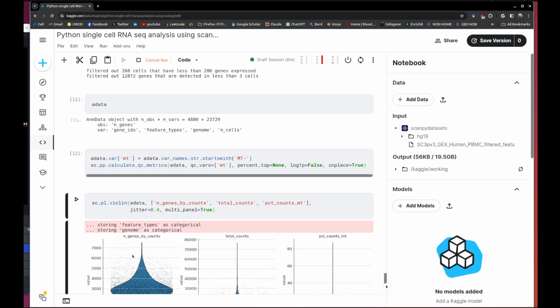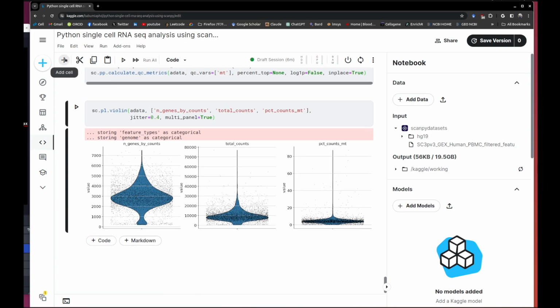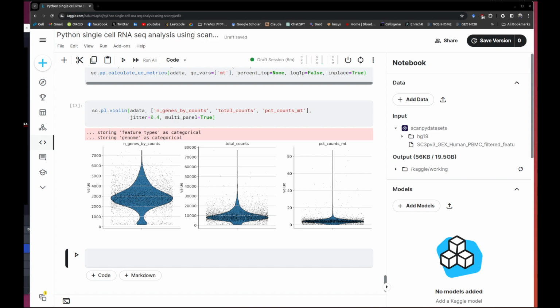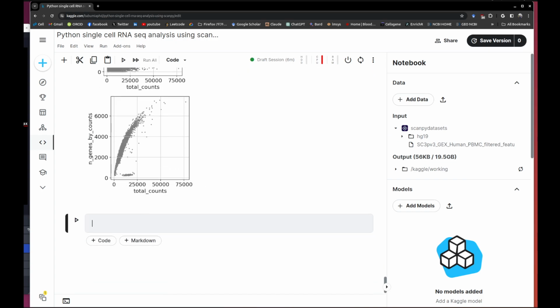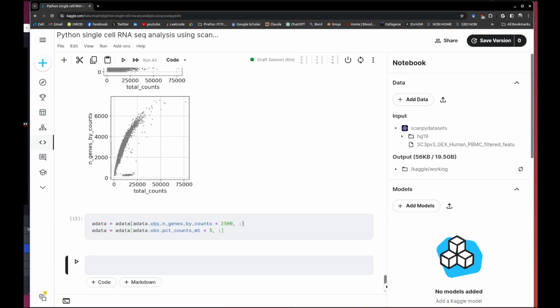We wanted to look at this, and then we thought, okay, this is a real picture, so why don't we do a next layer of original filtering. So we do this filtering, and now we want to look again after the filtering, how does it look?